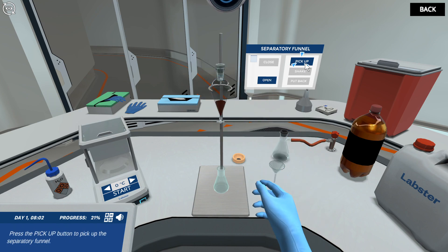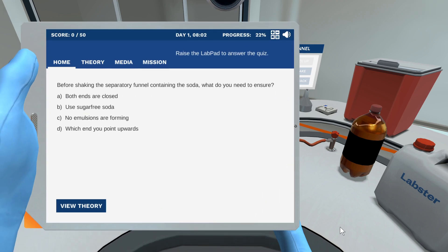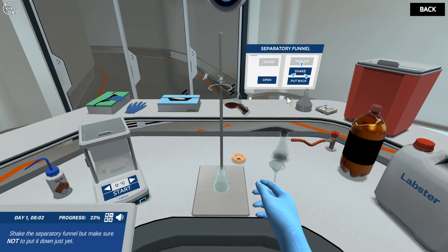Press the pickup button to pick up the separatory funnel. Before shaking the separatory funnel containing the soda, what do you need to ensure? That's correct. Shake the separatory funnel, but make sure not to put it down just yet.